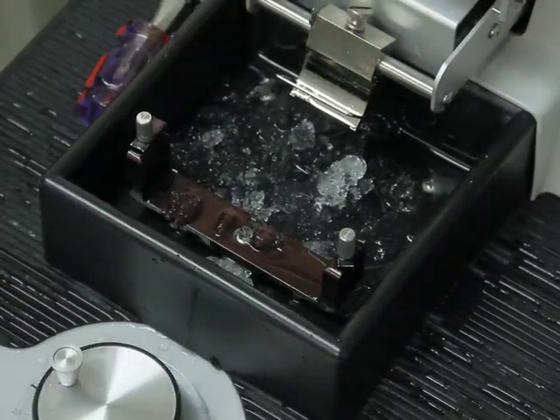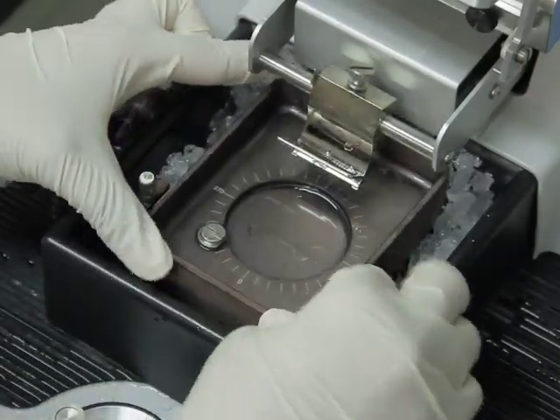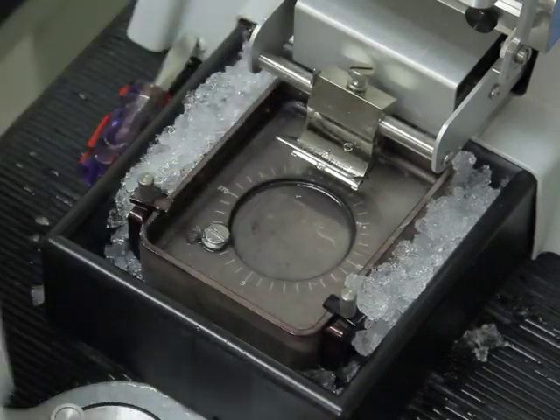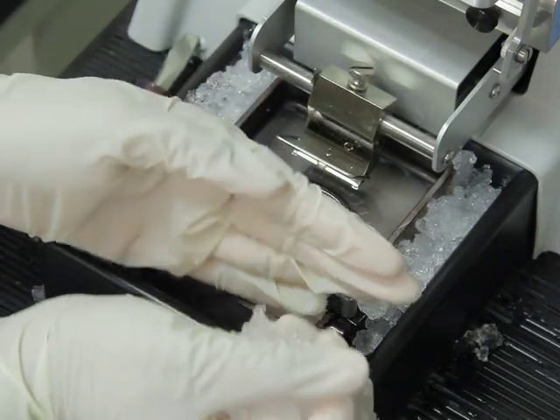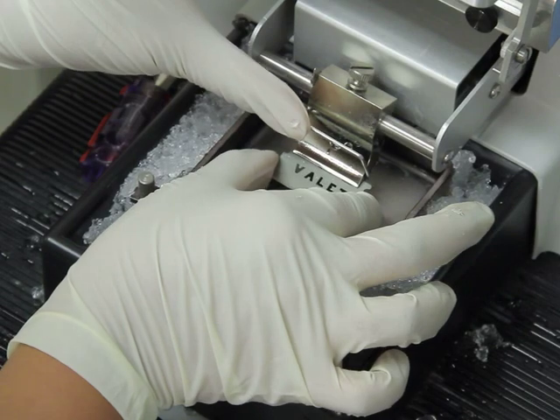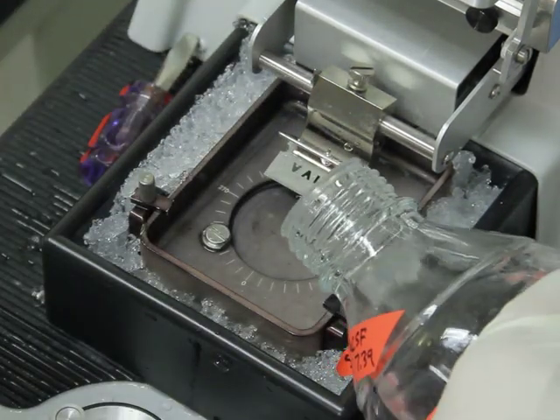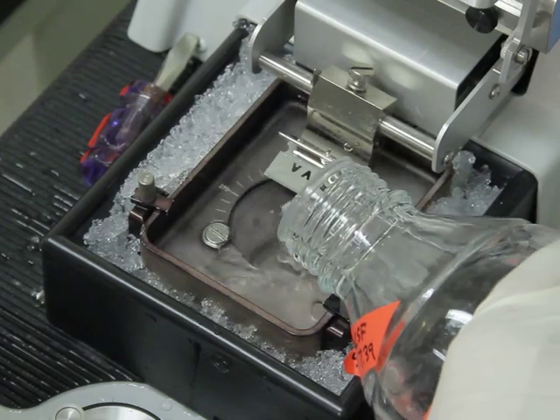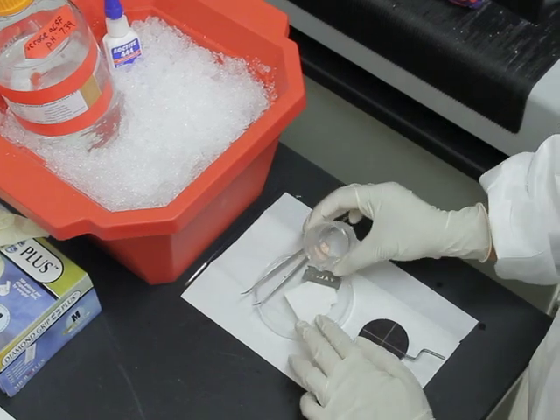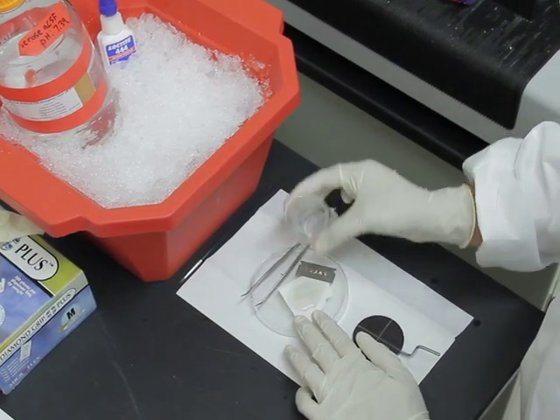In the meantime, prepare the vibratome for slicing. Place some crushed ice in the specimen bath, then place the specimen chamber in the vibratome and fix it firmly. Add more ice around the specimen chamber to fill the gaps and make sure that no ice gets into the chamber. Afterward, place a cleaned razor blade into the blade holder, then fill the specimen chamber with ice-cold sucrose ACSF. Subsequently, pour some cold sucrose ACSF on a piece of paper towel on an upturned petri dish.